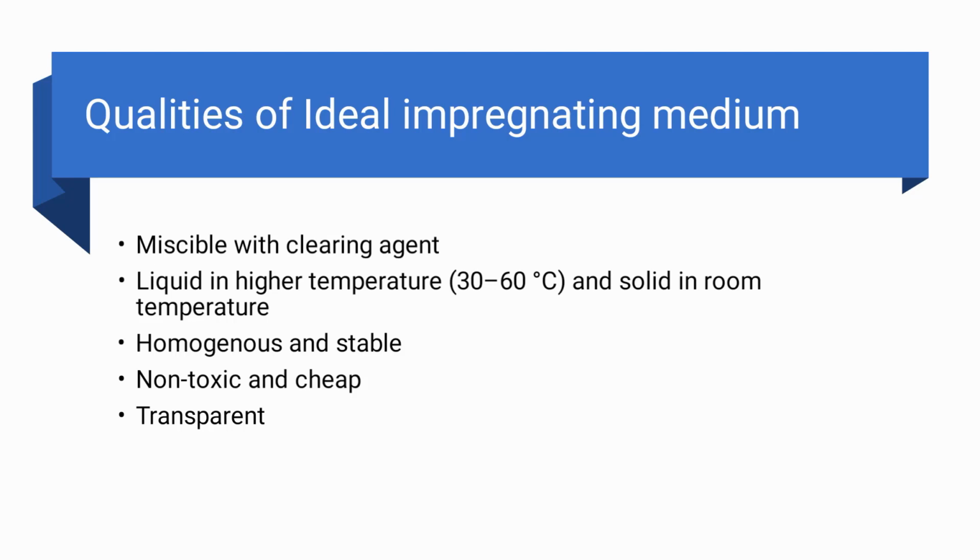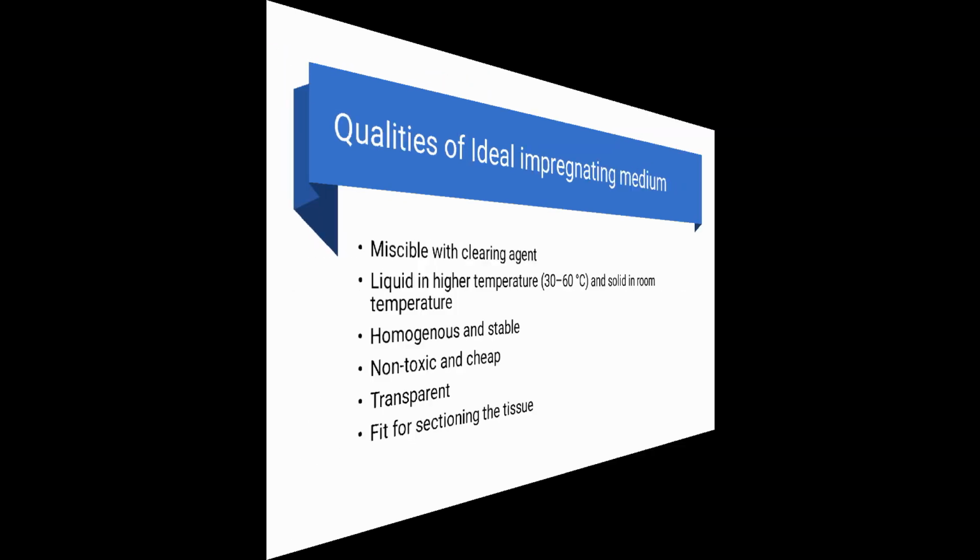It should be transparent, because when it is not transparent, it may hinder the staining process, and also it may hinder the microscopic examination. It should be fit for the sectioning of the tissue.